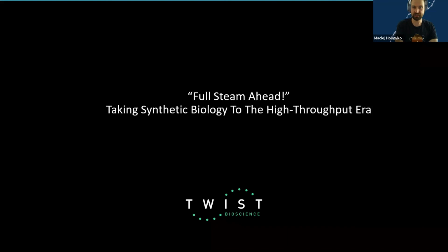Yes, we've recently acquired the Oxford Nanopore system. We don't know how much of a role it will be playing in the BioFoundry yet, but yeah, definitely sequencing, as Janet mentioned, is going to be part of our workflow. Okay.